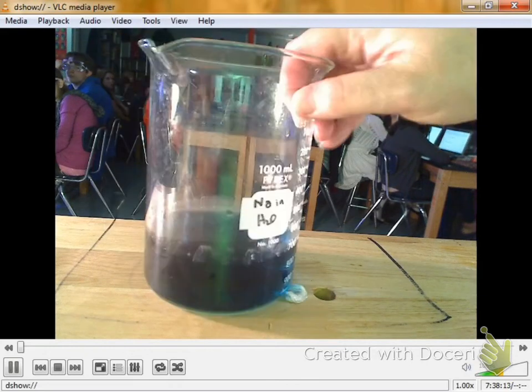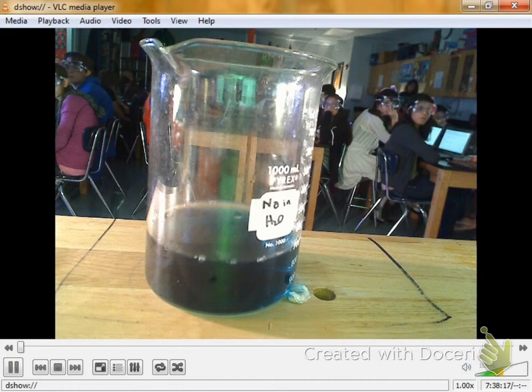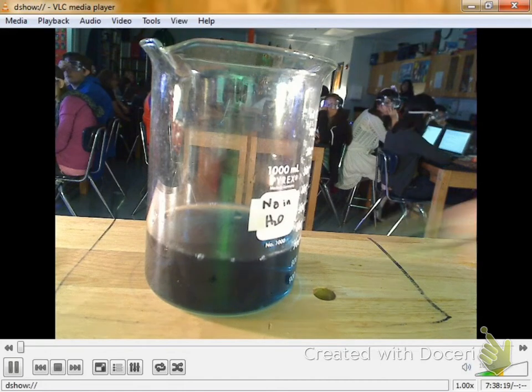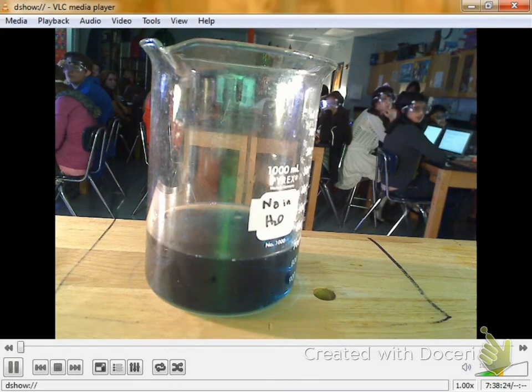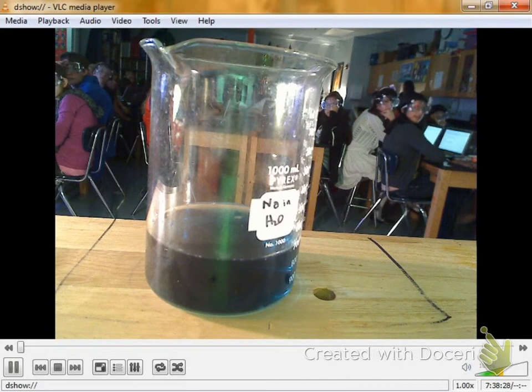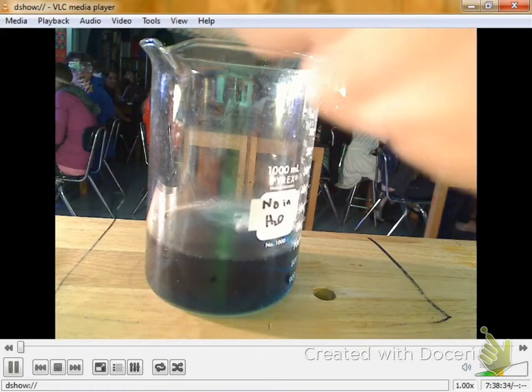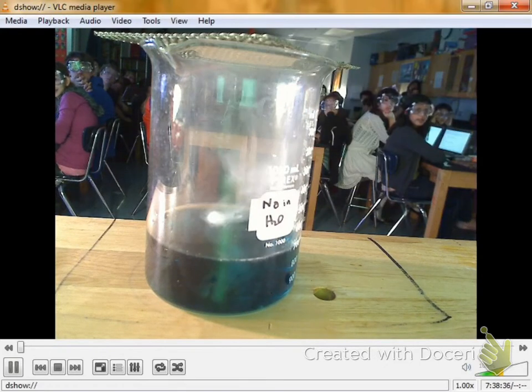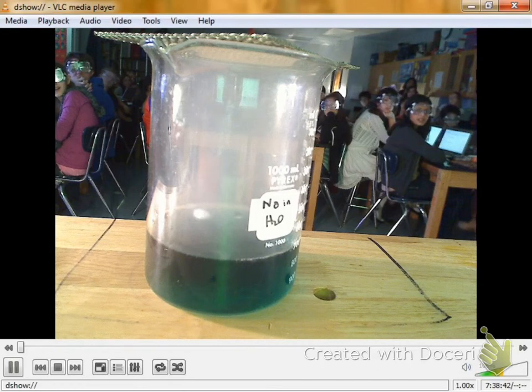All right. So here we go. I've got some very blue water. I've got one smashed up piece of sodium metal. Y'all better be watching because otherwise you're going to miss the fun. Okay, do you think more reactive or less reactive? More reactive. Yeah, I'd say it's a little more reactive.